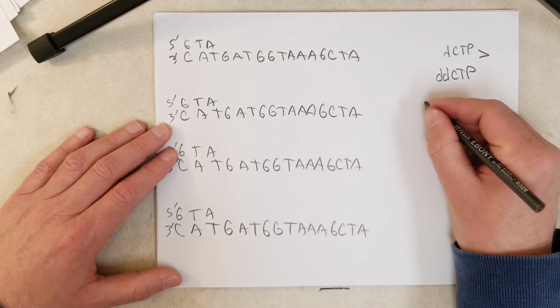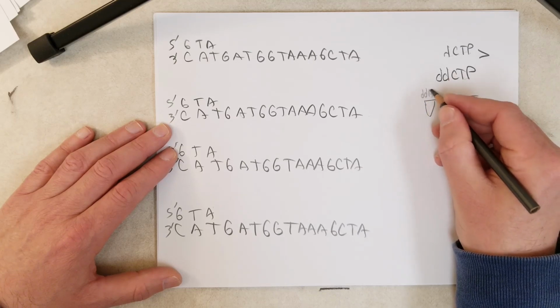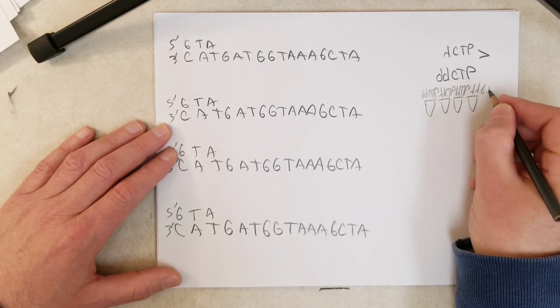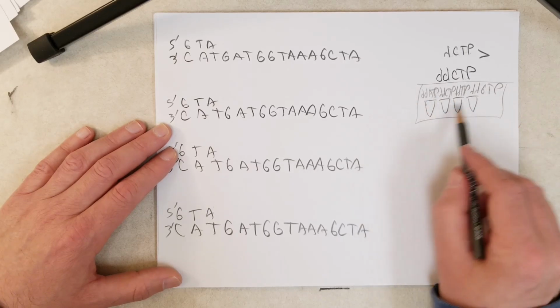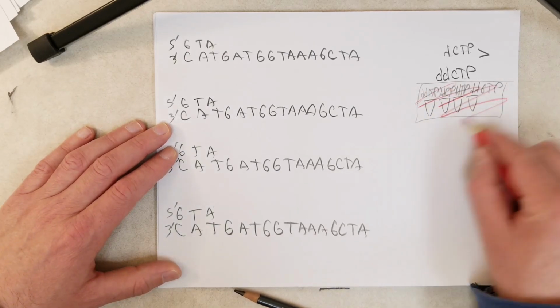So when we're sequencing DNA by the classical Sanger sequencing method, we need 4 reactions. One has ddATP added, one has ddCTP, one has ddTTP, and one has ddGTP. Just in case you're a little confused. So, okay, we're doing ddCTP now.